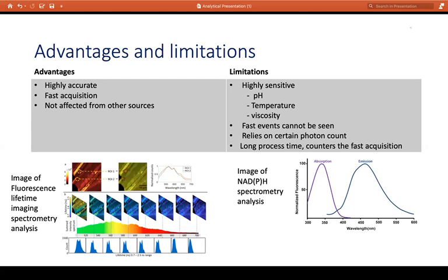However, this is also true for the counter. If the photon count is too low, the data shown will be poor. This Goldilocks zone, where the spectra can be obtained from, is also somewhere off being perfect. This is because the acquisition of the spectra is still slow enough for some fluorophores not to be detected. As a result, the detection isn't able to detect fluorophores with a short half-life, which can potentially mean cancerous tissue in biological organisms.